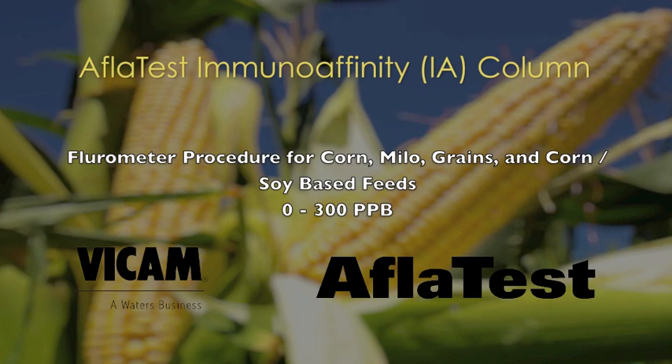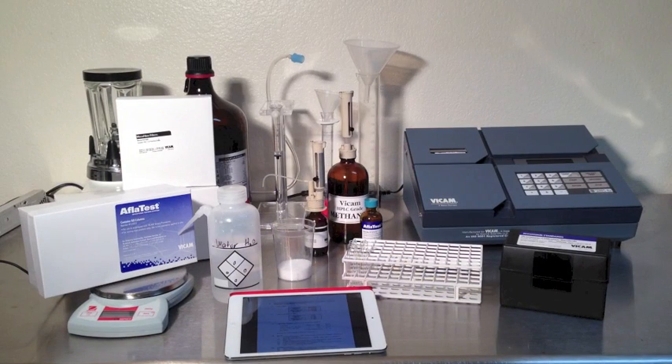AFLATEST fluorometer procedure for corn, milo, grains, corn and soy based feeds, producing results from 0 to 300 parts per billion.